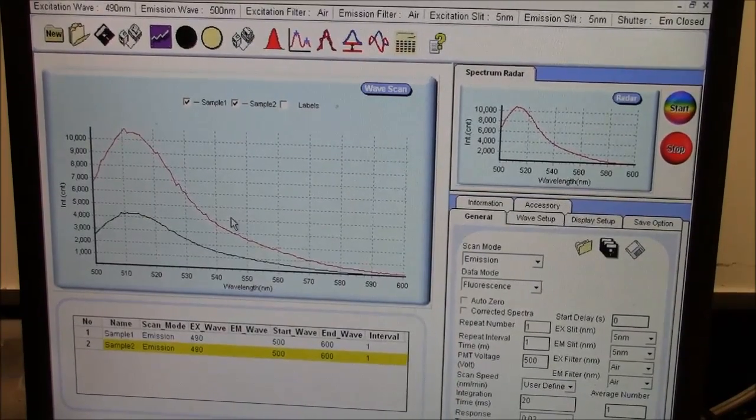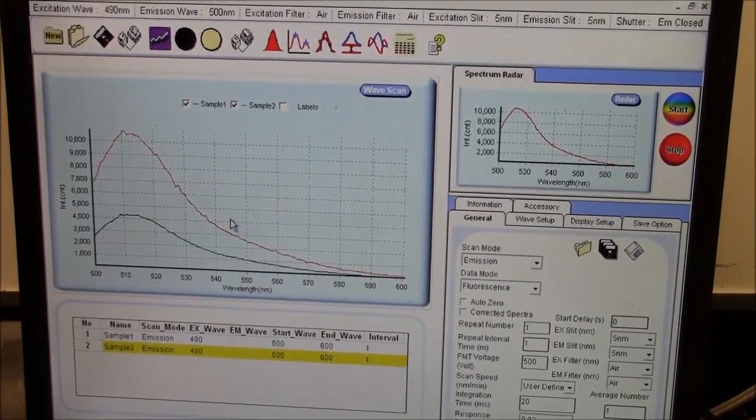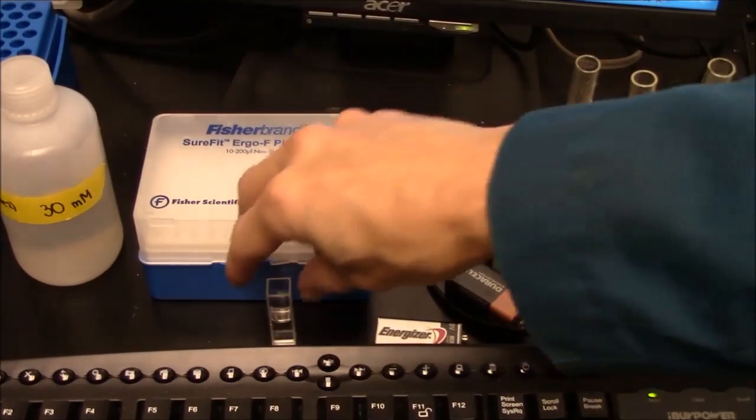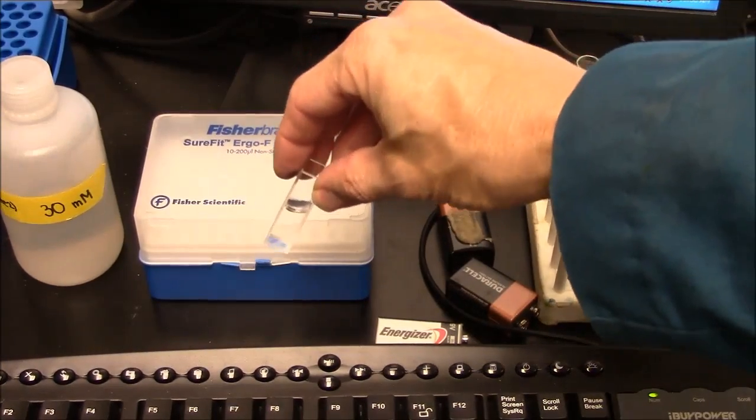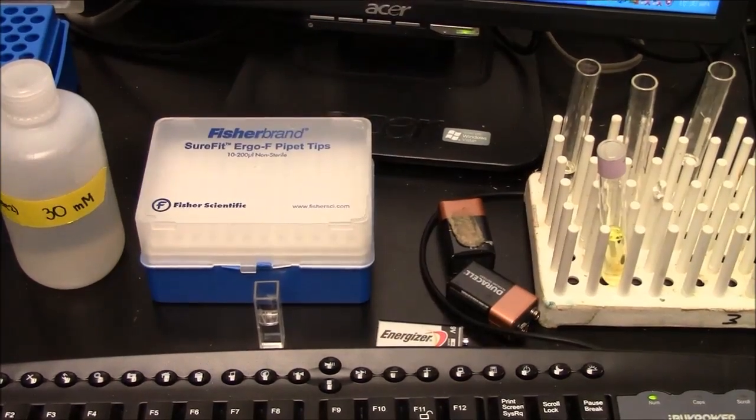This data can be printed, and I believe it can also be saved in an Excel file. I have not yet figured out how to do that. In the end, I will clean out my cuvette with distilled water. This is aqueous chemistry in this case, so no need for organic solvents.